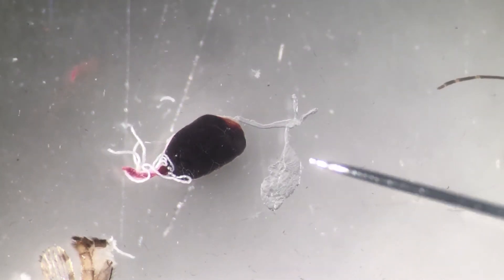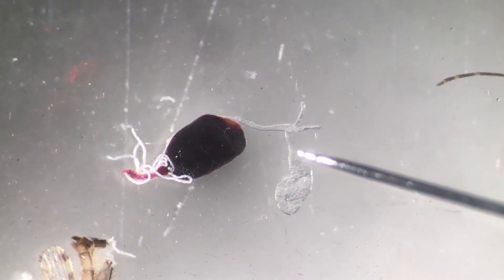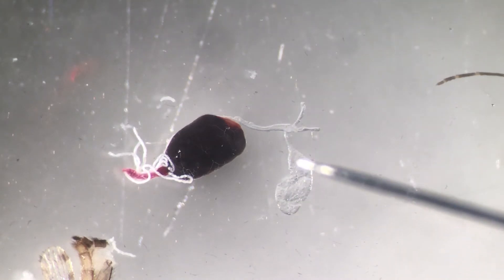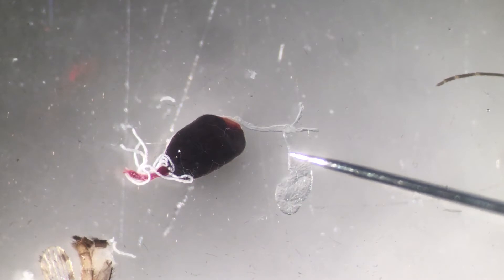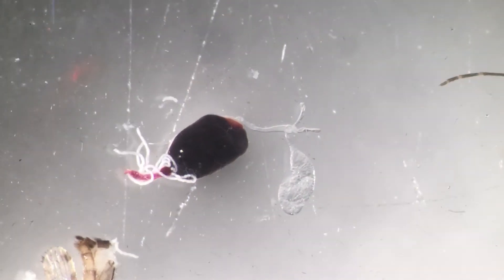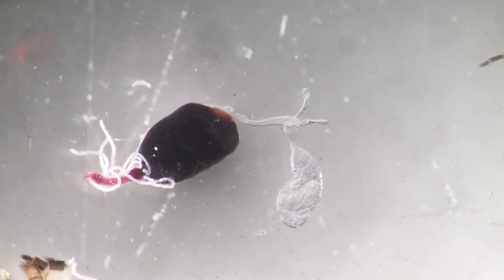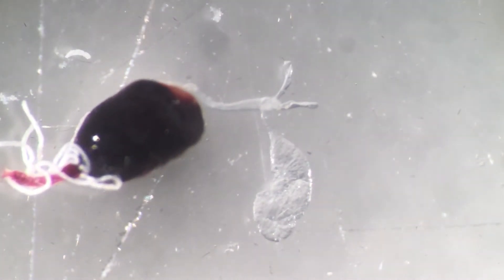Here is the mosquito midgut. We have the blood that has been digested, and this structure here is called the crop. The crop is a storage compartment where the sugar meal - anything that is sugar-based - is stored. Let's get a closer look at those nice peristaltic movements.